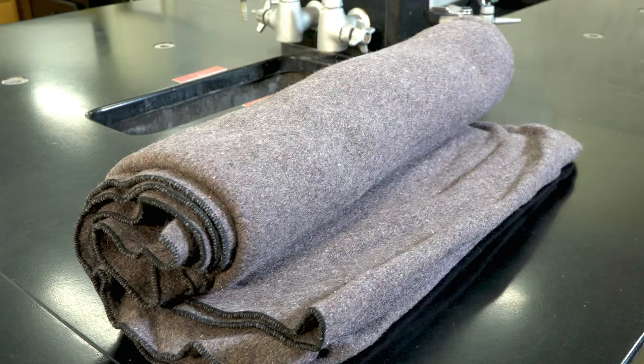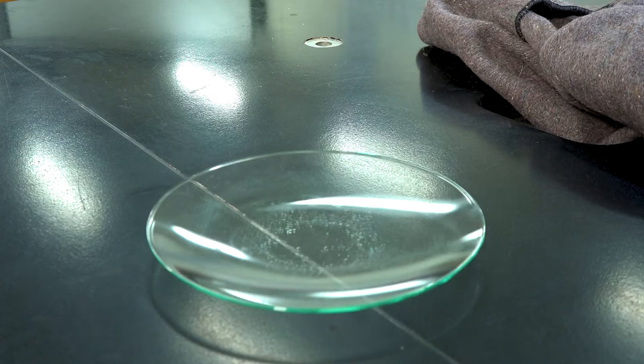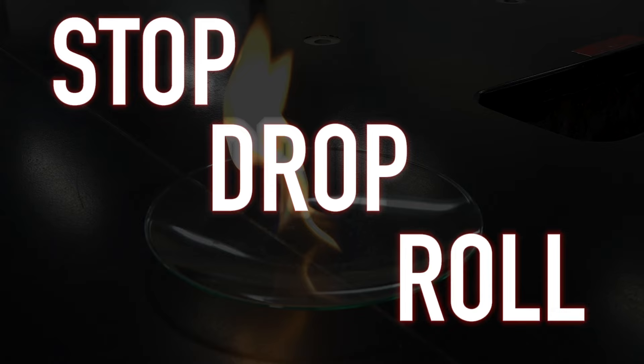For less serious fires, it may be more appropriate to use the fire blanket to smother the fire. Simply unfold the thick blanket and throw it over the fire. This will rob it of oxygen, safely smothering it. If your clothing or hair were to catch fire, stop drop and roll to put it out immediately.